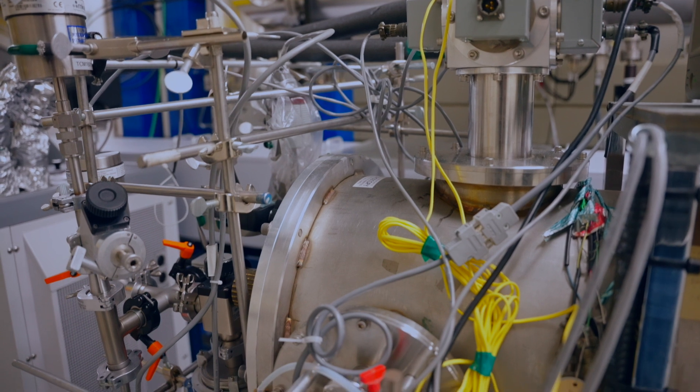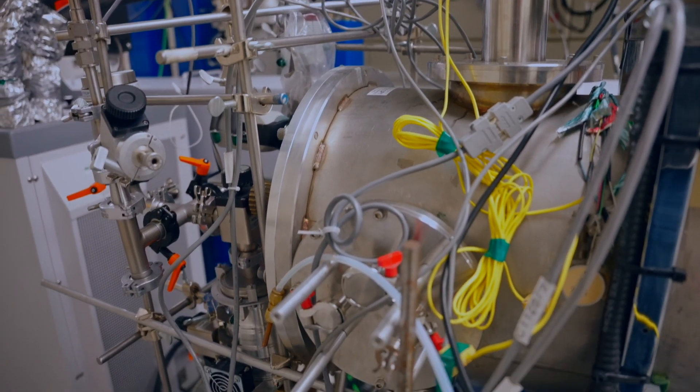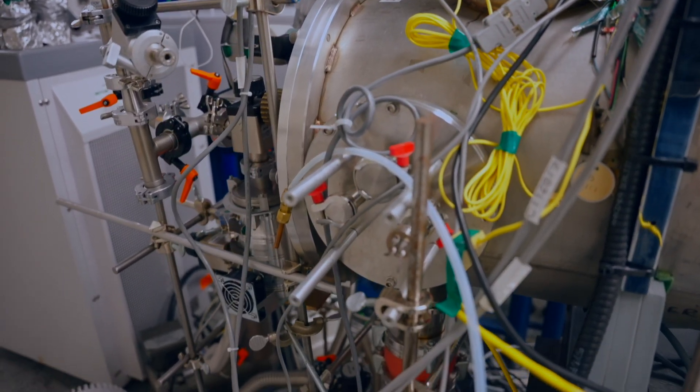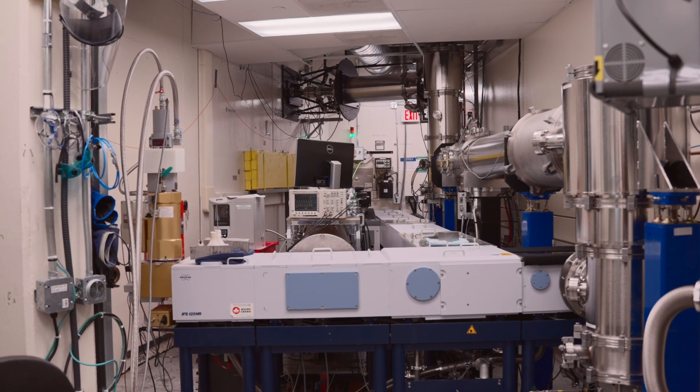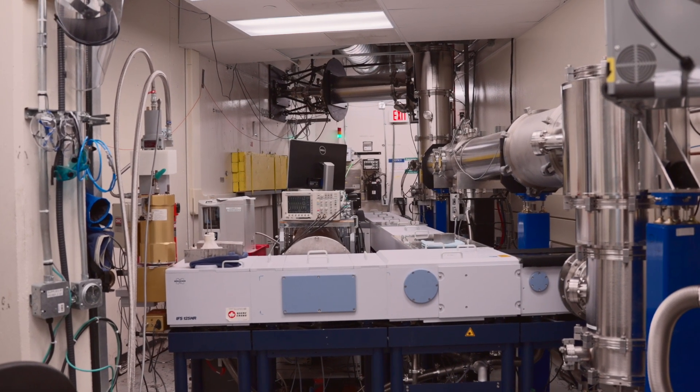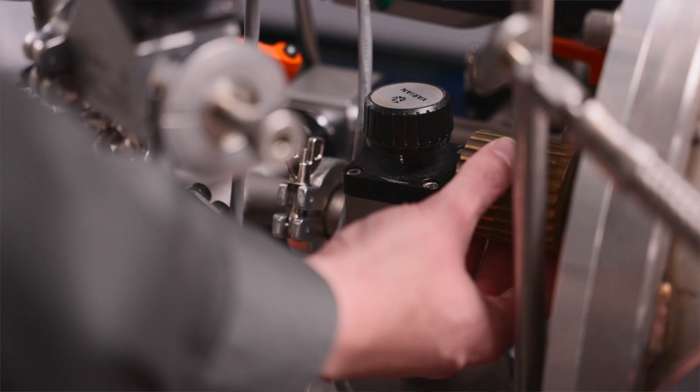It is also temperature controlled relatively easily from anywhere from about 300-320K down to about 200K using a recirculating chiller. If we really want to try hard, we can get down to 100K to emulate environments on other planets.